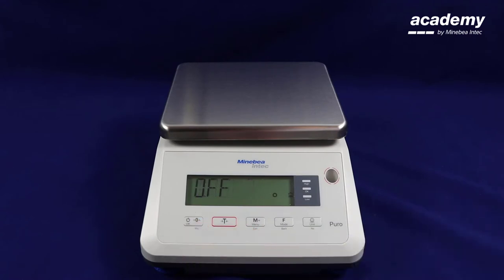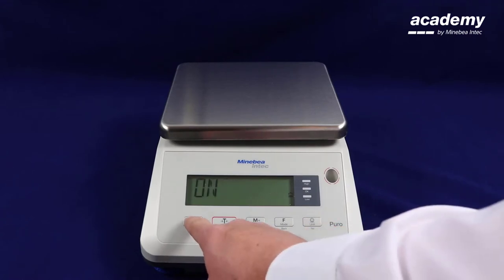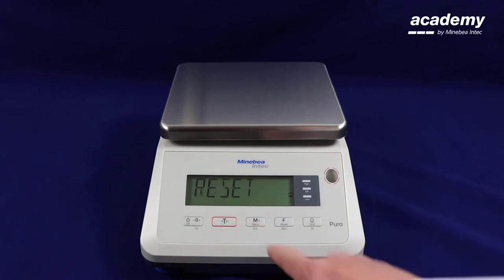Press yes to accept when it's on the screen. Use the no key to scroll to on and press yes to accept. Press the back key to get you back into the main scale.